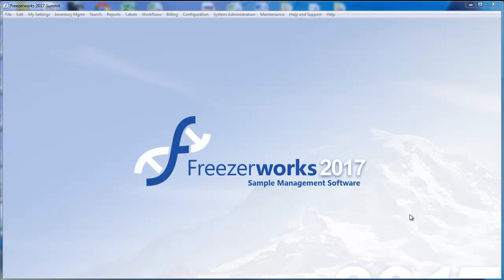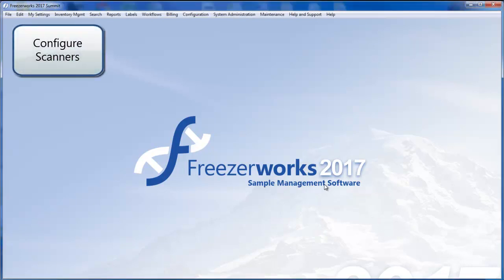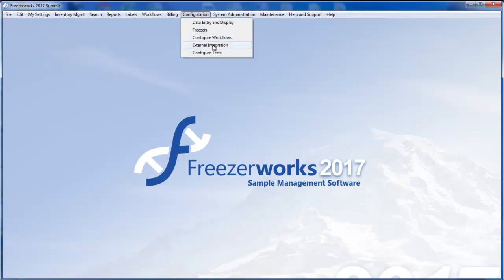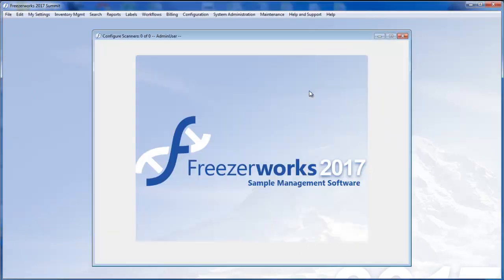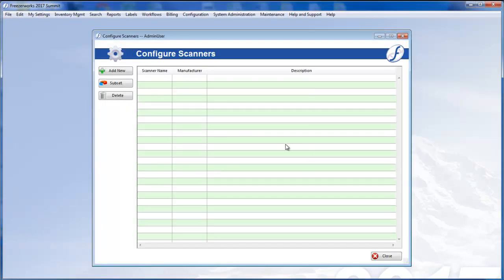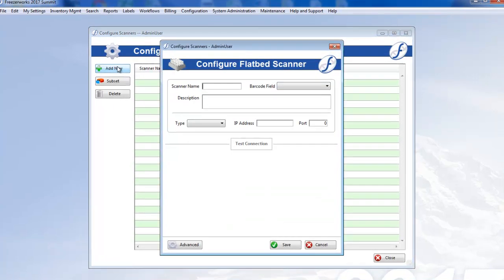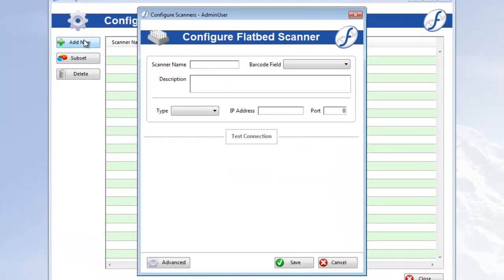To begin though, before you can use any flatbed scanners in FreezerWorks, you'll need to configure and test their connections. Open Configuration, External Integration, then select Flatbed Scanners in the mini-menu. This opens a flatbed scanner list view where you can add scanners and update any existing ones as well. We'll click Add New and the Configure Scanner form opens.